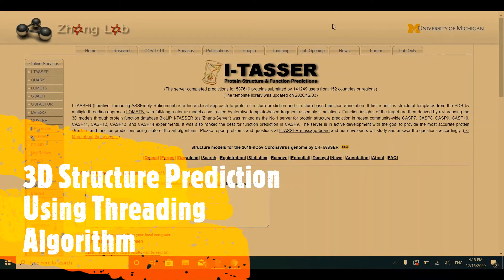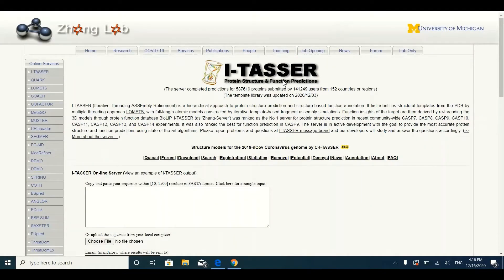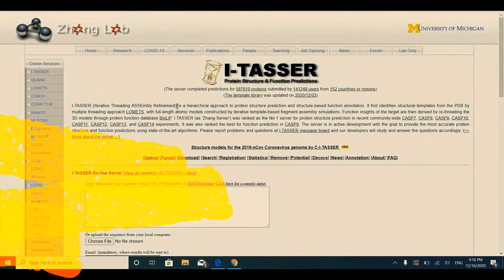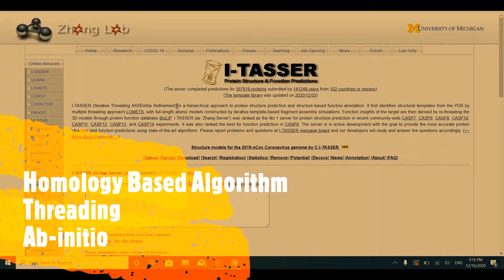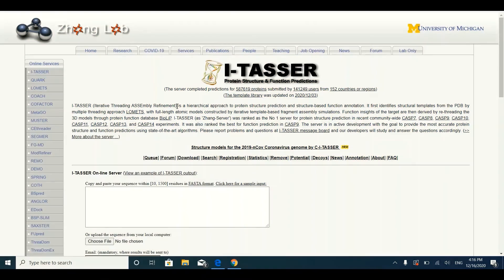In this tutorial we are going to use I-TASSER for prediction of three-dimensional structure of a protein. I-TASSER stands for Iterative Threading Assembly Refinement. This program is based on the threading algorithm. There are three different types of algorithms which can be used for prediction of three-dimensional structure of the protein.